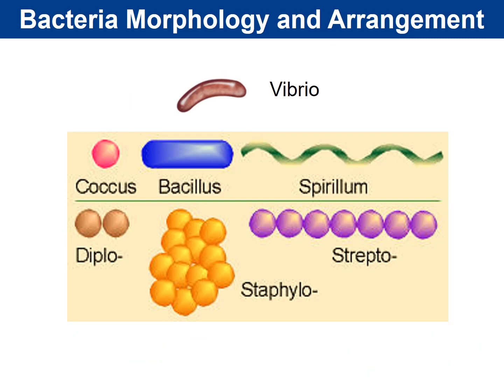So when we look at the bacteria, we're going to look at various types of morphology. And so some bacteria are going to appear coccus-shaped, or plural cocci. Some bacteria are going to be rod-shaped, what we call bacillus-shaped. Plural would be bacilli. Some bacteria would be what's called spirillum, and these are going to be rigid spirals.